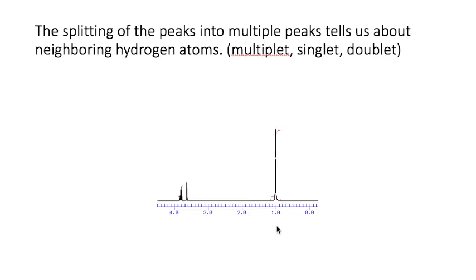And this one over here is a doublet. So there's a peak here, and then there's another peak here. There's 2 peaks closely spaced together. And that's all extremely important information. That gives us information about the environment, but specifically, are there hydrogens next door? So you remember when I was mentioning TMS, tetramethylsilane, there are no hydrogens on the silicon directly, so there's no hydrogen next door to any other one. And that's really important. So let's take a look at that.